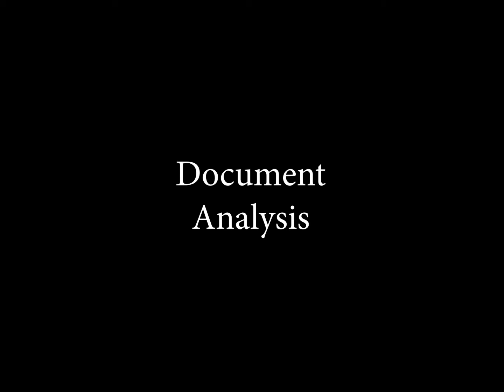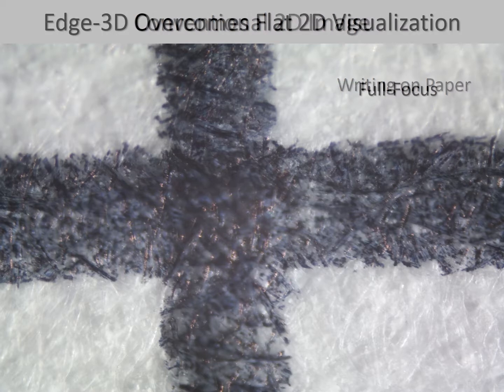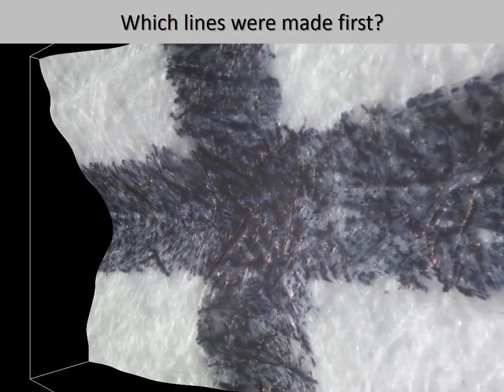Document analysis is an important area of forensic science to determine forgeries and counterfeits. Here is a two-dimensional image of 2 strokes of a ballpoint pen on paper. Here is a full focus image of the 2 strokes of the pen. The question is, which stroke was created first? A 3D model shows that the pen strokes create tiny grooves in the paper.